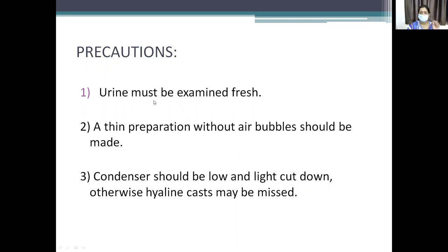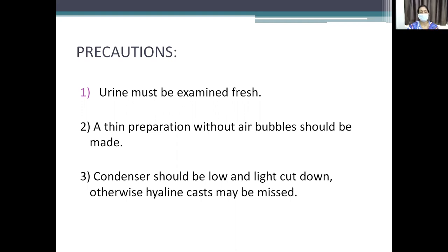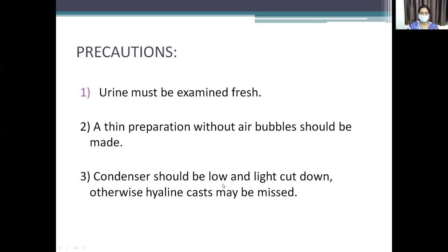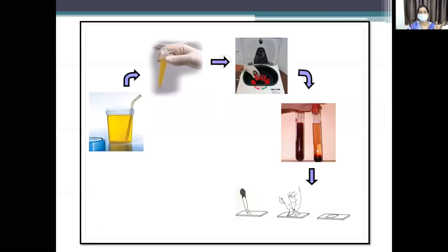Precautions for urine microscopy: fresh urine only must be examined, because sugars may degrade, abnormal formations can occur, and uric acid crystals can form in standing urine, interfering with interpretation. A thin preparation without air bubbles should be made. The condenser of the microscope should be low and the light cut down; otherwise, hyaline casts may be missed.